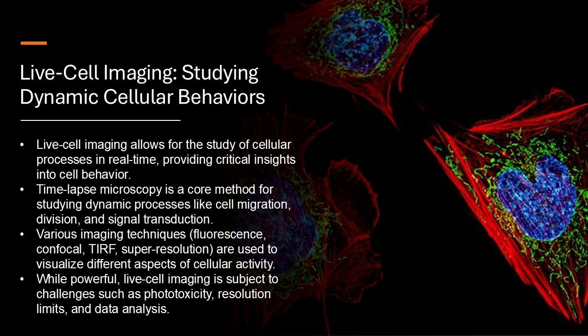So what sorts of things are researchers learning from these cellular movies? Well, one area where it's been really impactful is studying cell migration. So that's basically how cells move around, and it's essential for everything from wound healing to immune response. I can imagine that being pretty important. But how does watching it unfold in real time change our understanding?